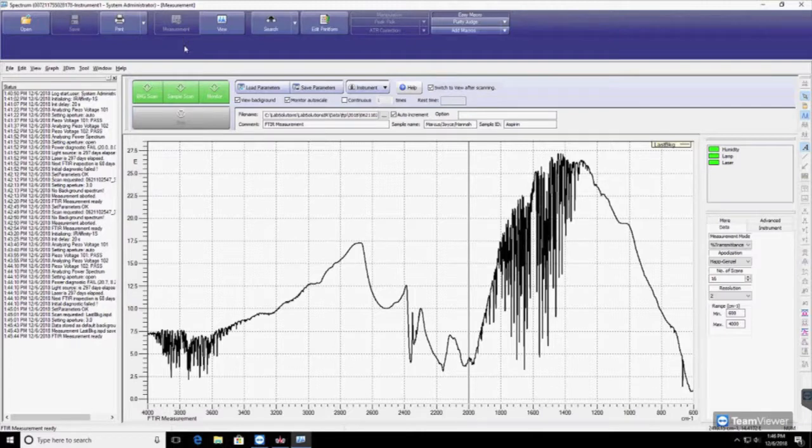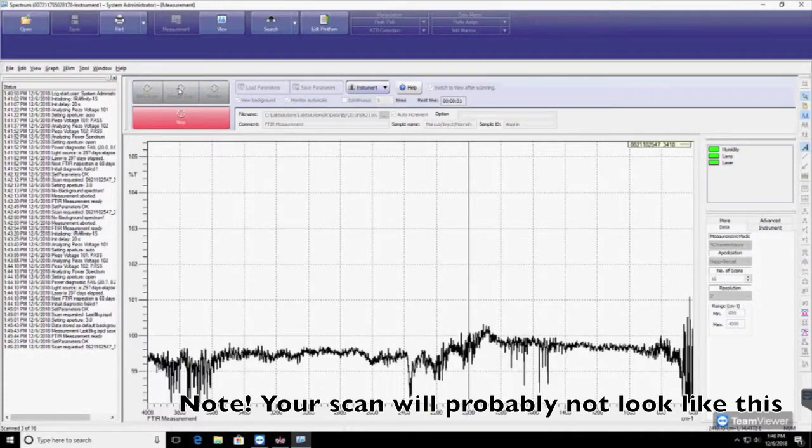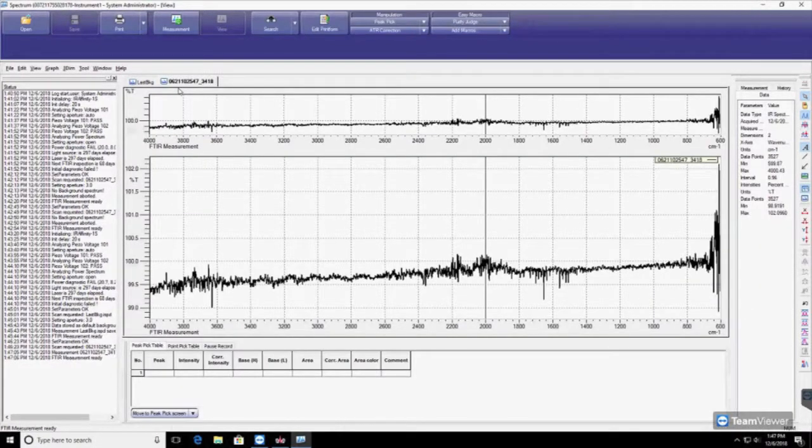Click on Measurement and select Sample Scan. Once the scan is complete, you can label the peaks by going to the menu and selecting the cursor, then selecting Auto Cursor. Move the cursor to the peak you'd like to label and click. You can also select a range of peaks by dragging your cursor.